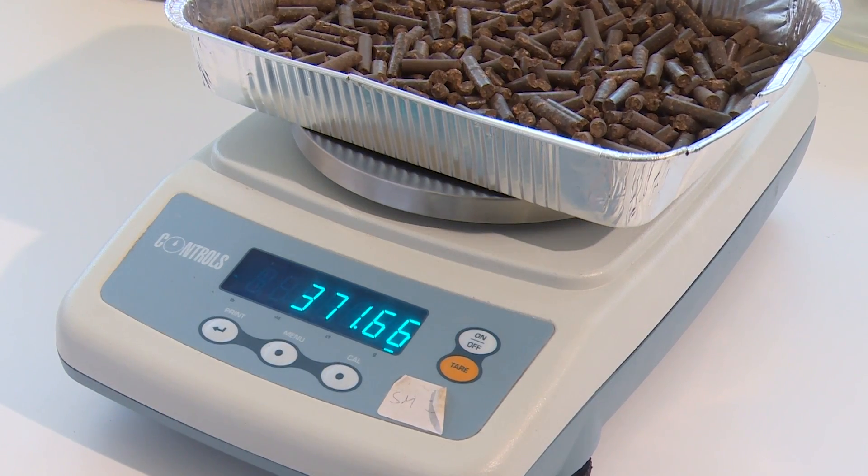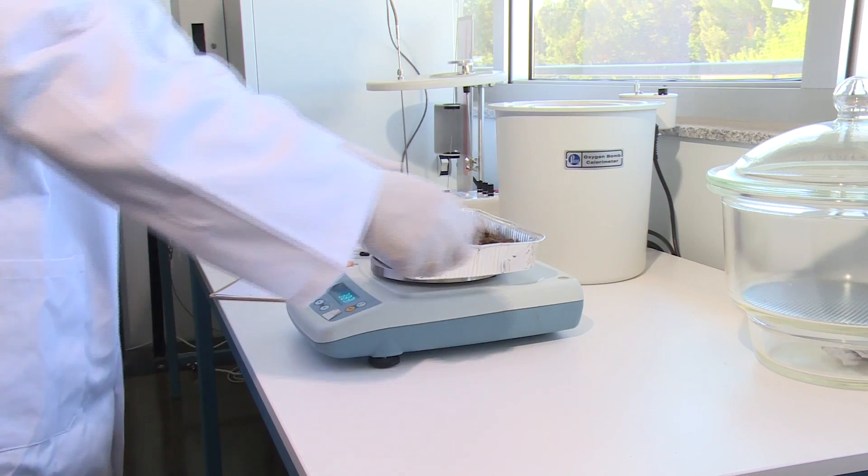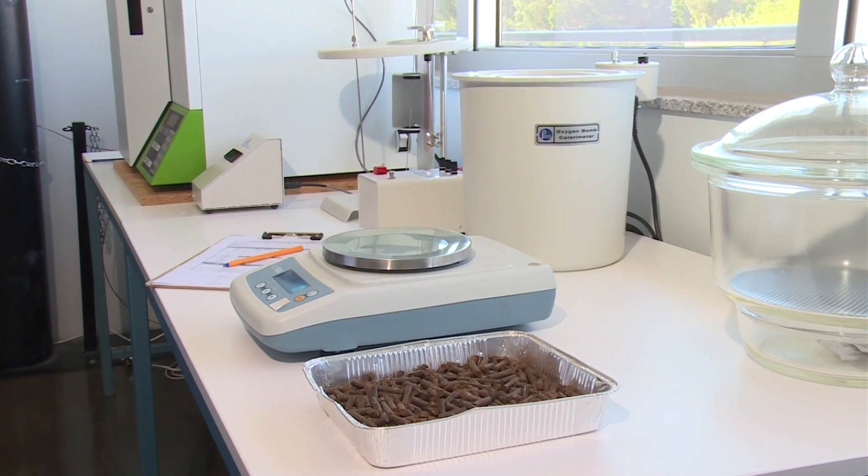A balance having sufficient accuracy to enable the sample and tray as received to be weighed to the nearest 0.1 gram is also needed.